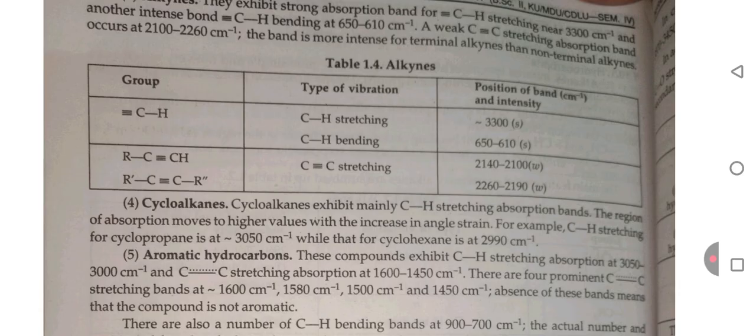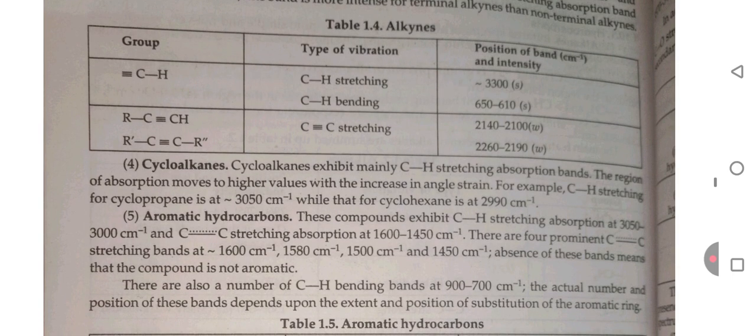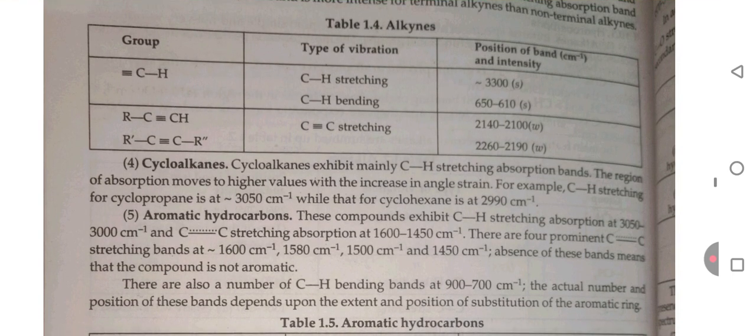Fourth, cycloalkane. Cycloalkanes exhibit mainly CH stretching absorption bands. The absorption moves to higher values with the increase in angle strain. For example, CH stretching for cyclopropane is at 3050 cm⁻¹, while that for cyclohexane is at 2990 cm⁻¹.